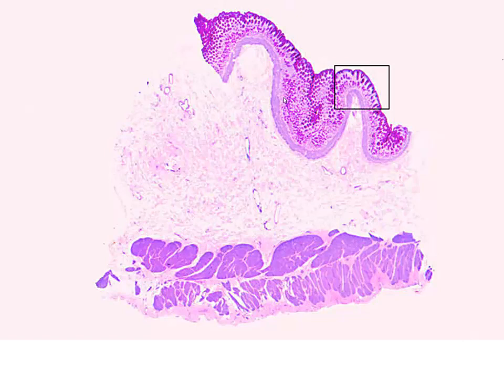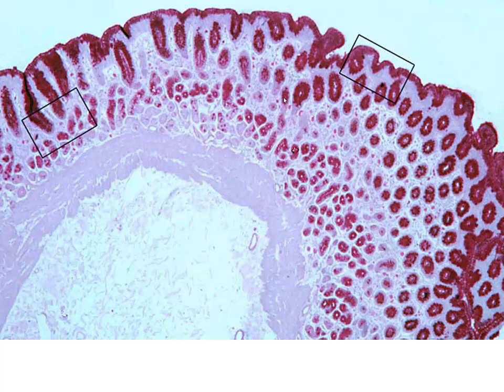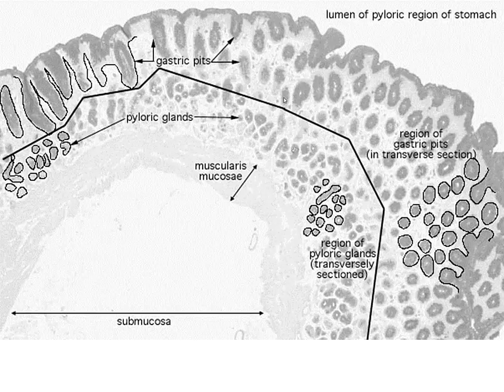Right, now we're going to look at a different stain that's really picking up the mucus granules. This is going to be the dark staining material that we're going to be looking at. So here we can see all of the cells that are involved in producing the mucus, whether we're talking about the visible mucus or some of the more goblet cell type lubricating mucus. That's what we're seeing with these red granules in this red stain picking up all of the mucus material.